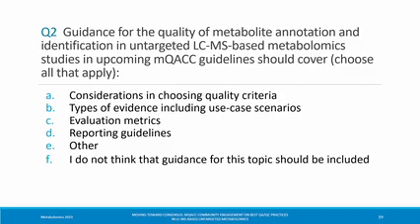I'm just going to follow up on this. If anybody's interested in the reporting standards group, come and see me. We don't want to tell anyone what to do. We want to nudge and advise. That said, if you're reviewing papers and you feel that the paper is making claims without providing sufficient quality assurance and control evidence, then we are strongly encouraging you to ask for that further information to be provided. I think that's basically quality assurance at an article publishing level. That should obviously depend on the grade of paper.